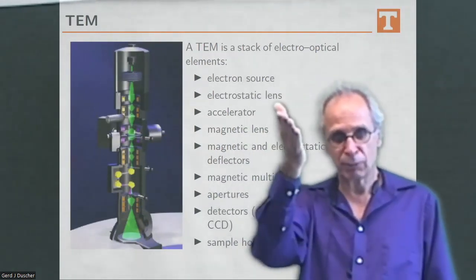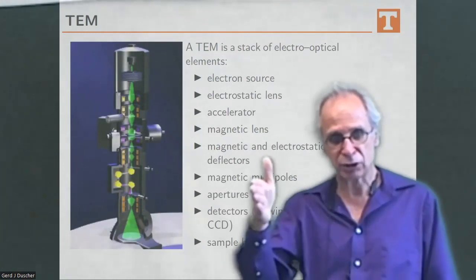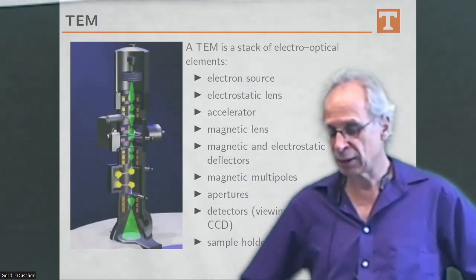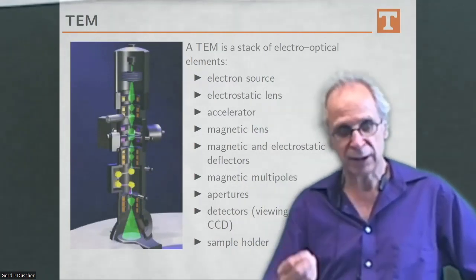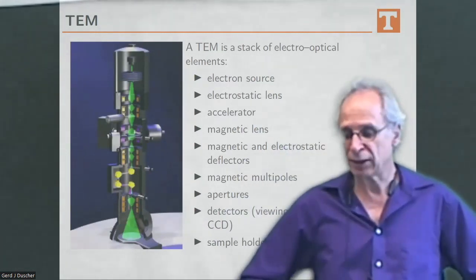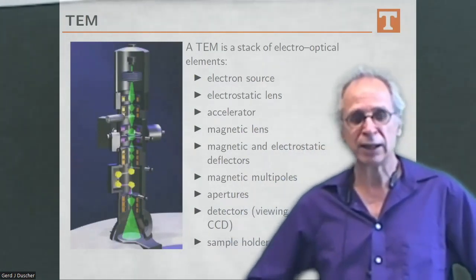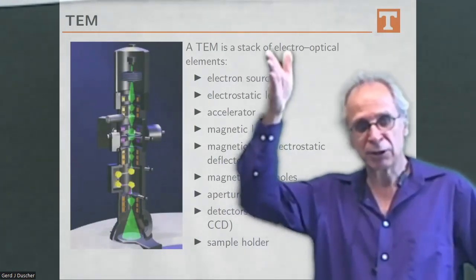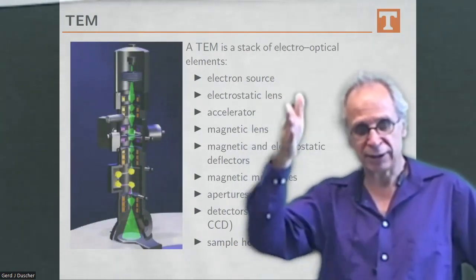So we first deflect it, then we deflect it back. So we have a spatial change. On the bottom, we have to do the opposite to get it back in the optic axis of the microscope. Optic axis of the microscope means basically the electron optical middle of the lenses has to be always established, and that varies a little bit from day to day. So the electron microscope has to be aligned. That means with deflectors, we try to get through each lens on the optical axis of the lens through the microscope.